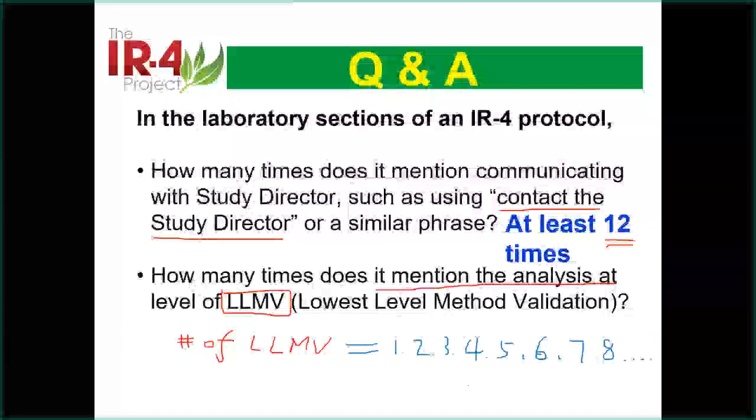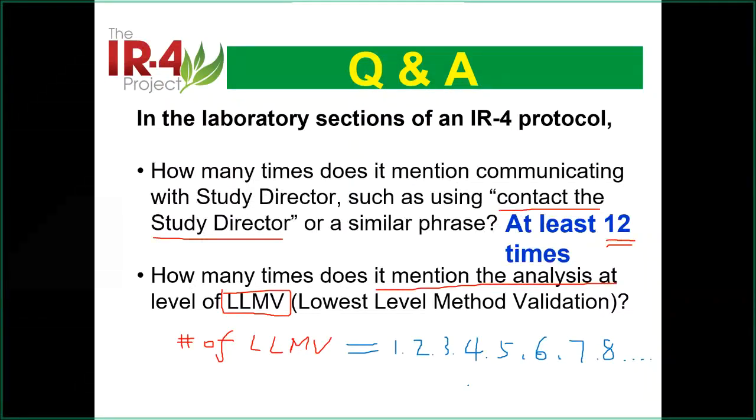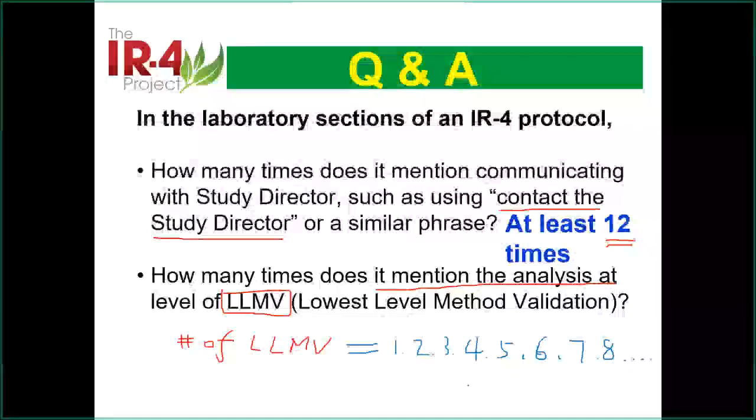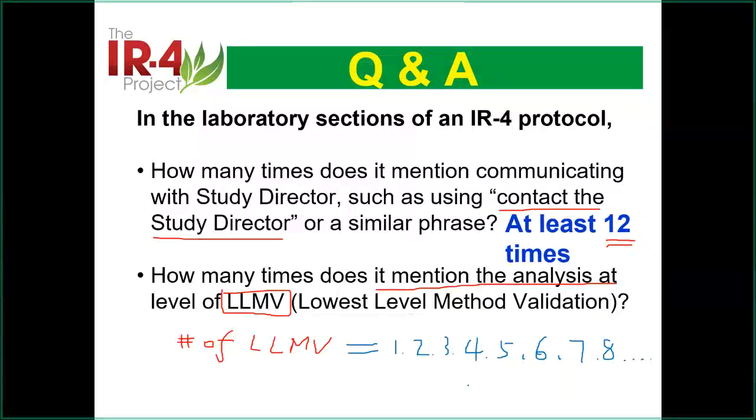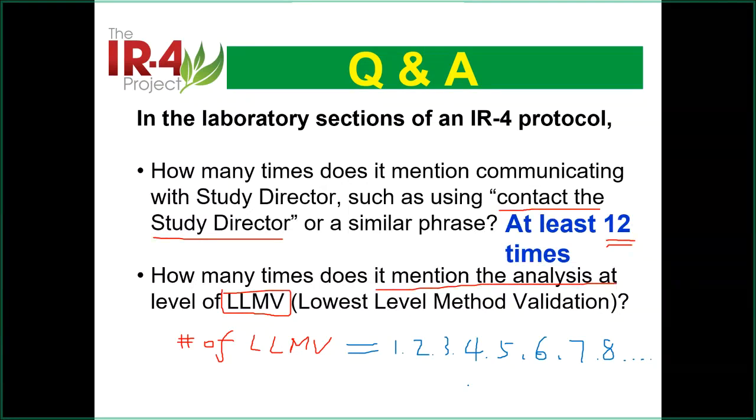Why? Then how about the samples you analyzed just before that? Yesterday, I ran a set of samples, okay? That's 20 samples there. And the samples after that, are you sure the samples are still good? Or something happened right after you finished the analysis? In that case, you need to tell people, make sure the set is okay. So that's non-routine. EPA inspectors are very picky on this thing.